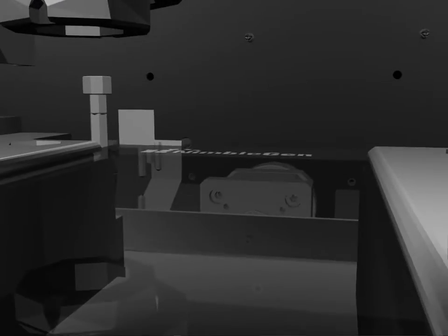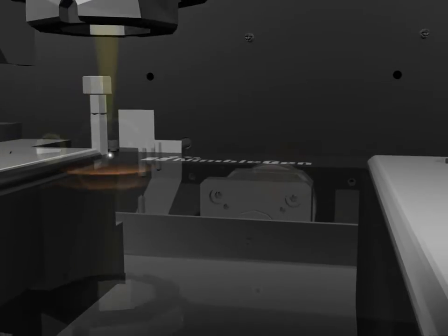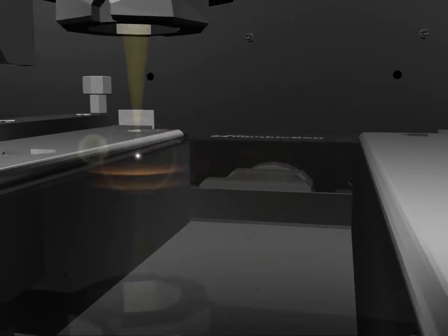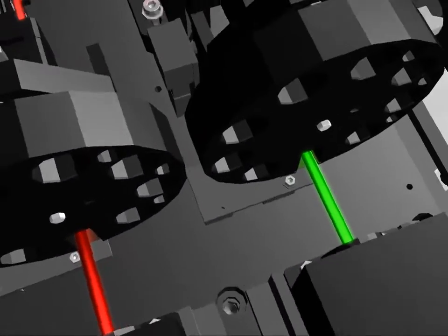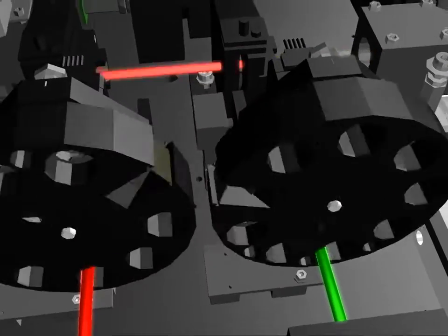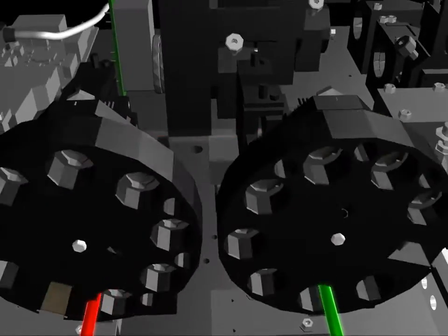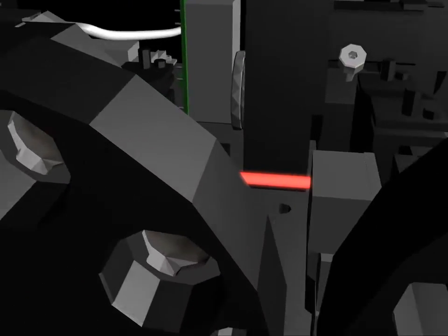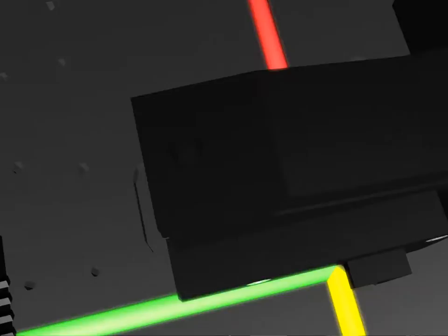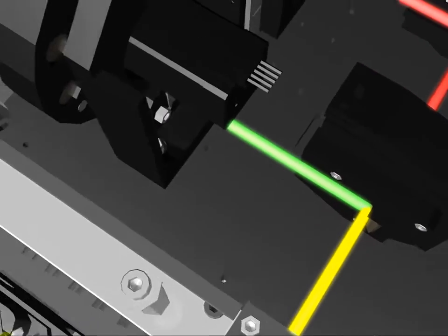The autofocus capability enables scanning with optimal focus position and angle. With a patent-pending optical design for reliable two-color measurements, the MS200 enables fast, sensitive and exceptionally precise scanning.